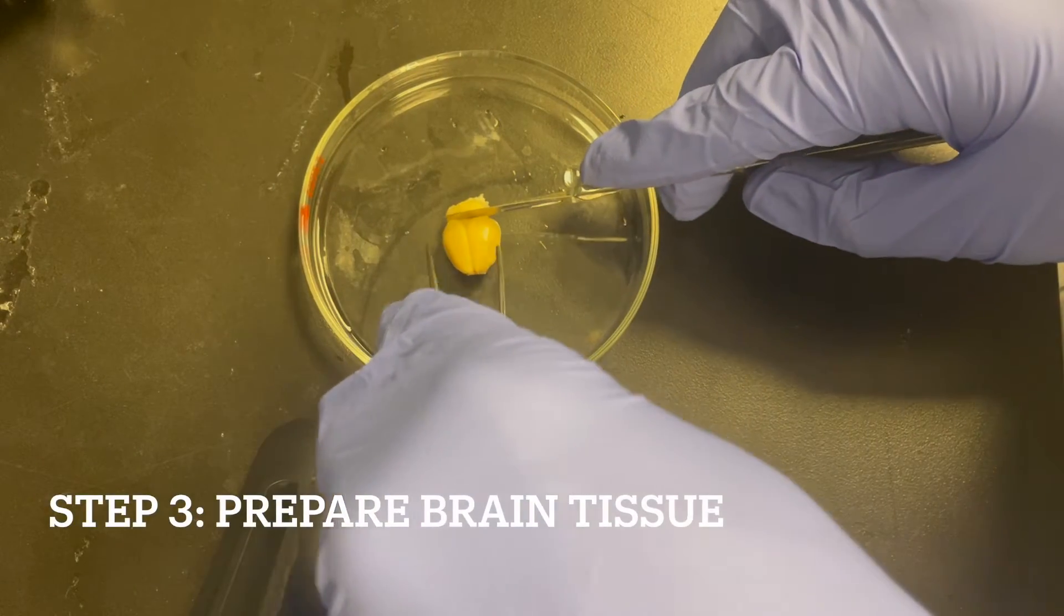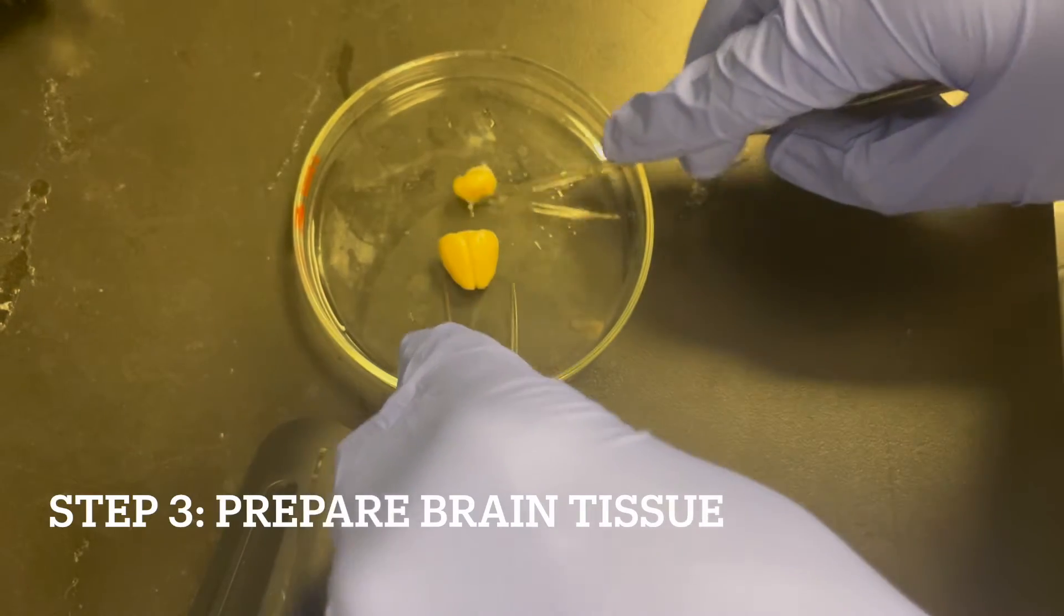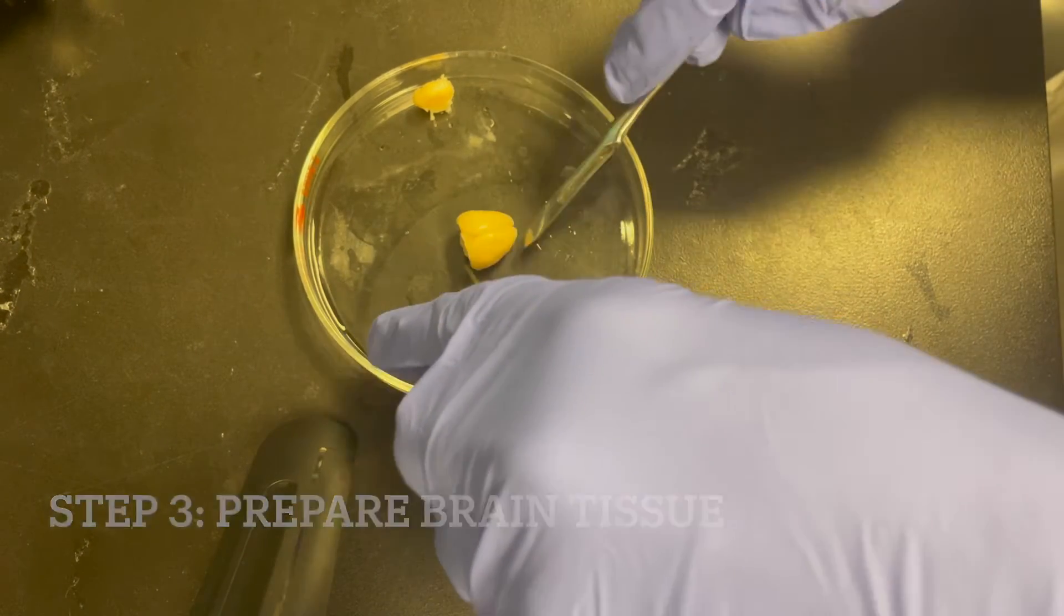Now to prepare the brain tissue for mounting, we cut off the cerebellum from the brain. This is a very important step because it creates a flat edge that can be used for mounting. Ensure a straight and precise cut.